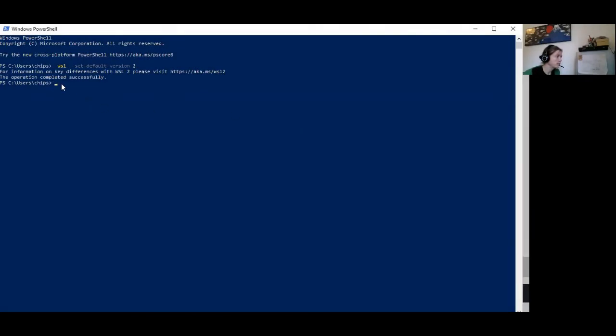To build the container for Tame NMR after you download, we again go back to PowerShell, and this time we want to cd to the location where we extracted the zip file that we downloaded from GitHub.